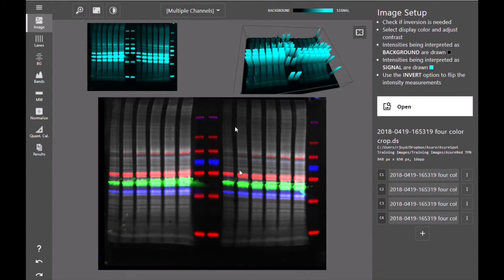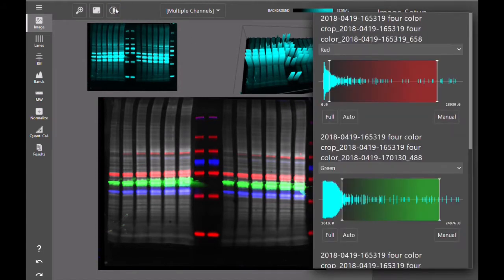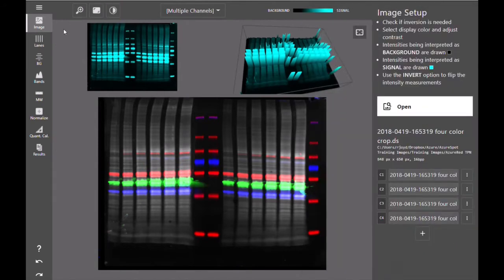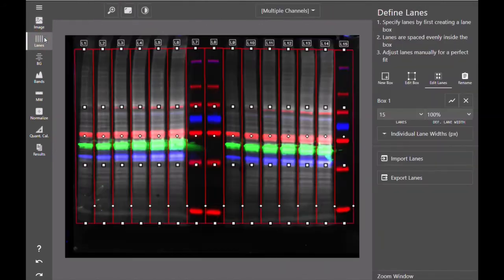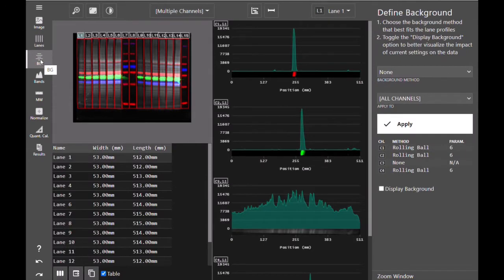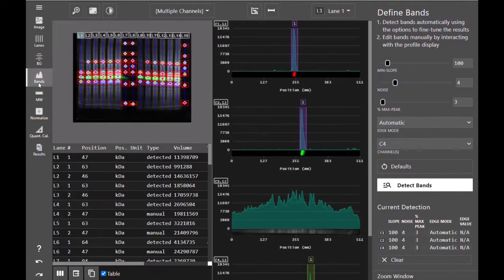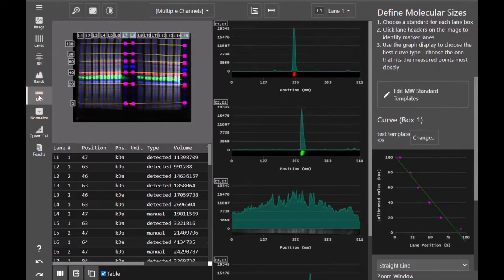In our previous video we adjusted the contrast of the image, we created our lanes, subtracted background from the channels containing our proteins of interest, defined our bands, and determined the molecular weight of our proteins.